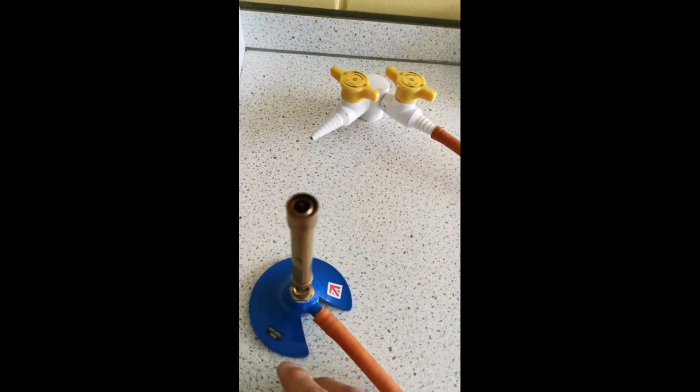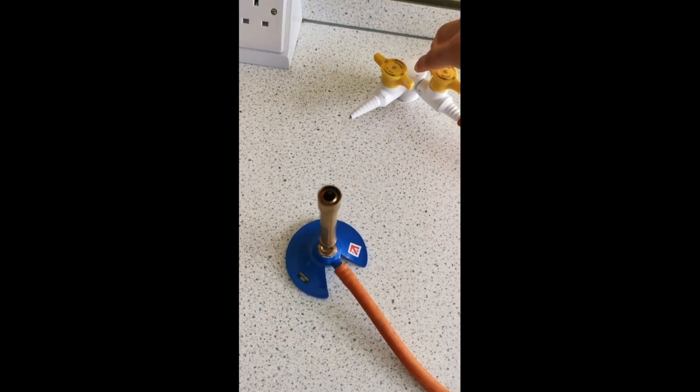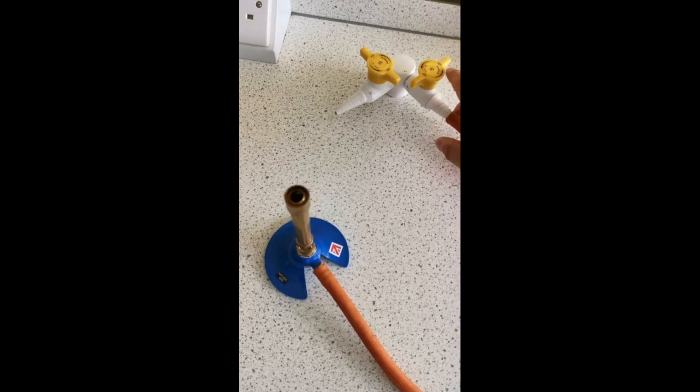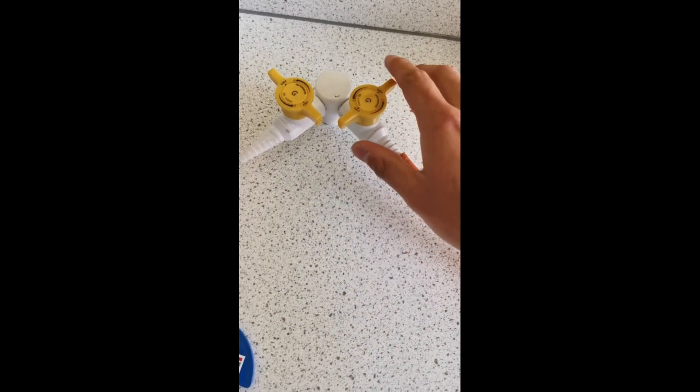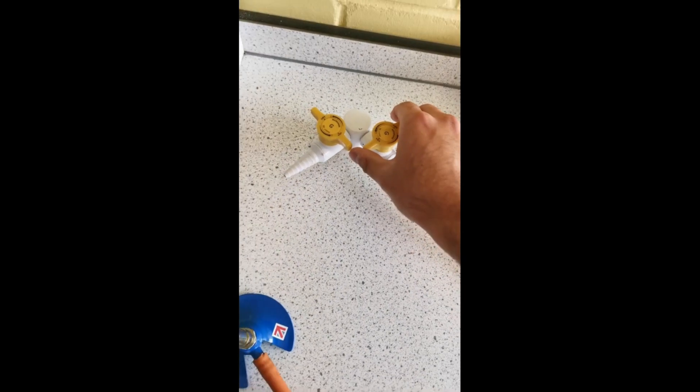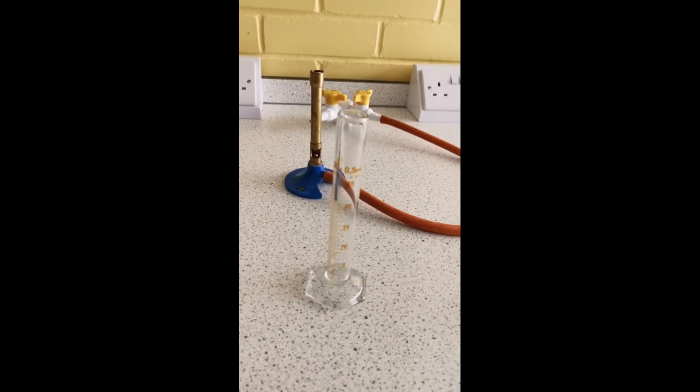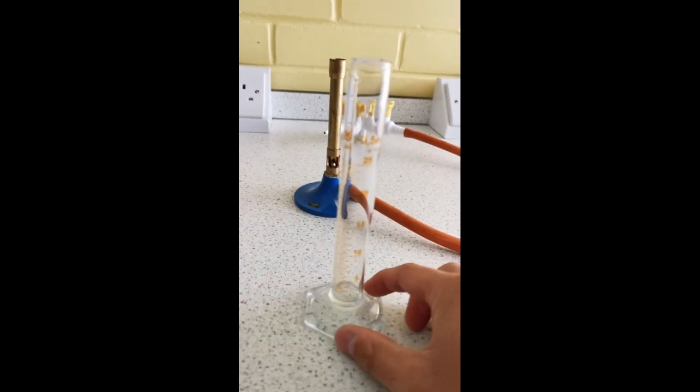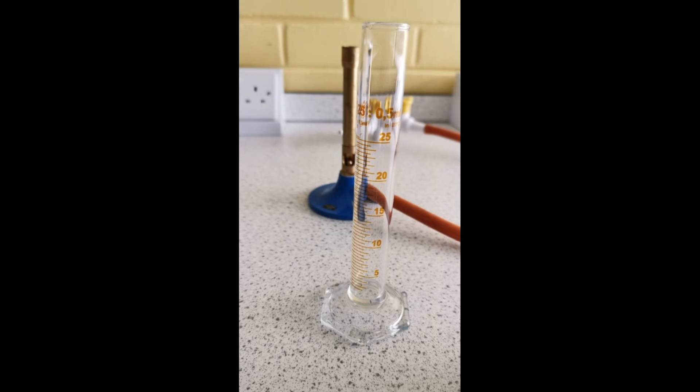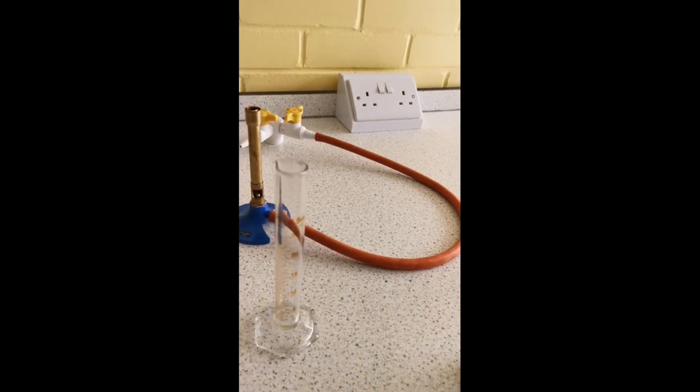You can hear it. To turn it off, twist it the other way. As you can see on the gas tap, it says on and off. Now we want to use five milliliters of water each time, and we're going to use this measuring cylinder to measure out those five milliliters.